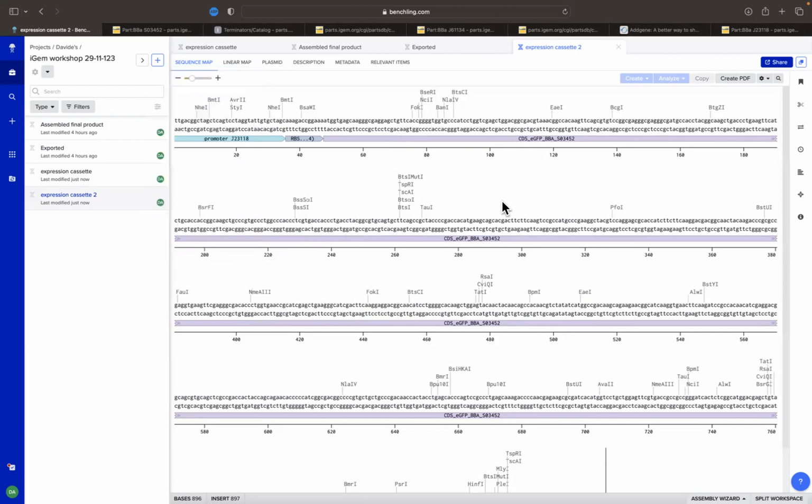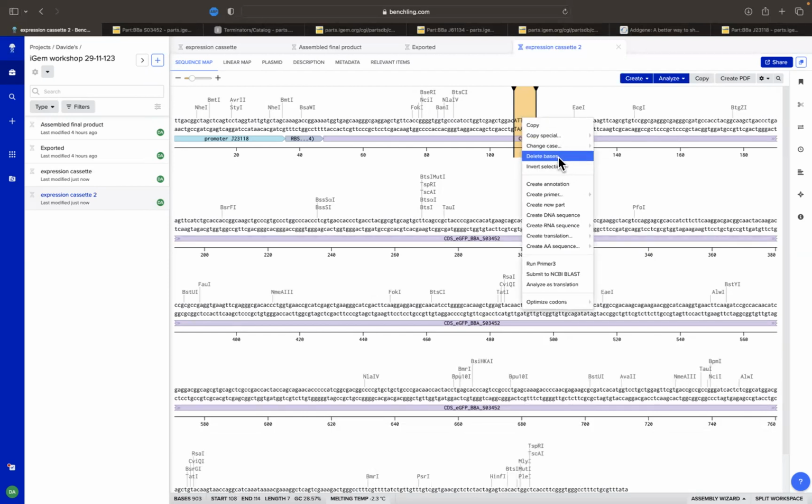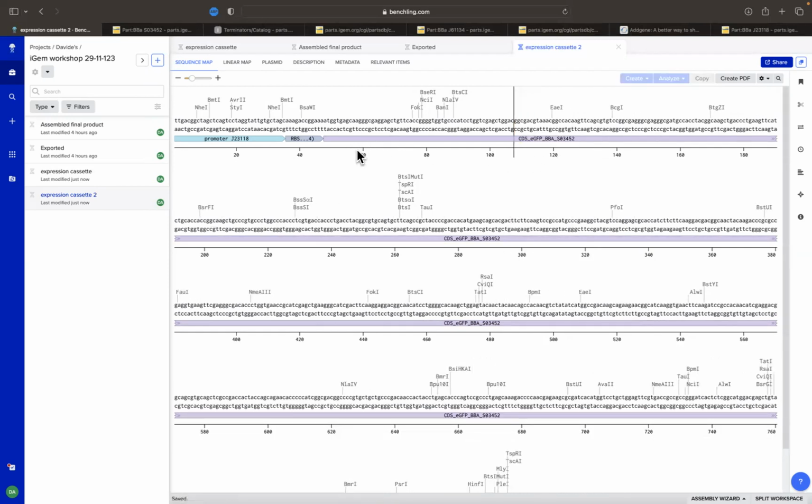In this case, you copy and paste the sequences one after the other, and you can also copy and paste sequences in the middle of the others. So like here we can do insert bases and write, I don't know, ATT, GCT. Obviously, if you do something like that, you're going to break your frame, or you're going to add amino acids that you don't want. So just don't do it because it's not really helpful. But you can also add sequences at each point of the Benchling sequence you have.